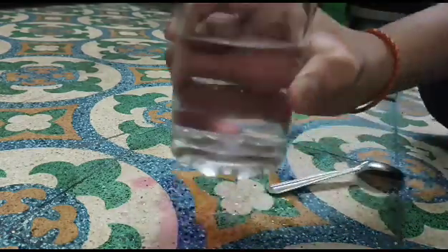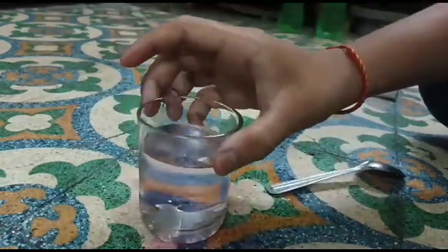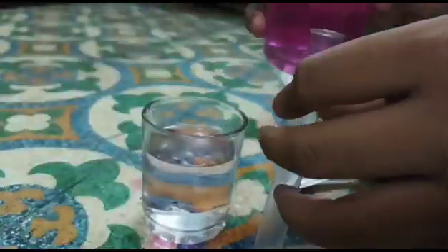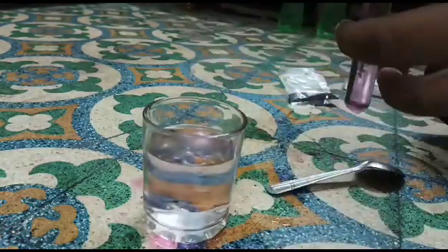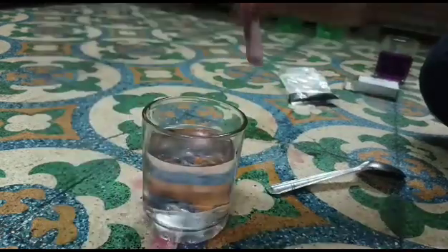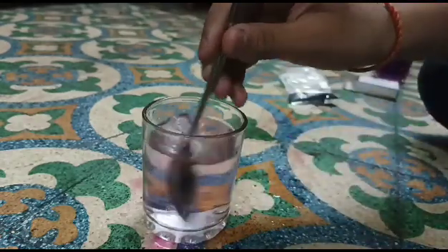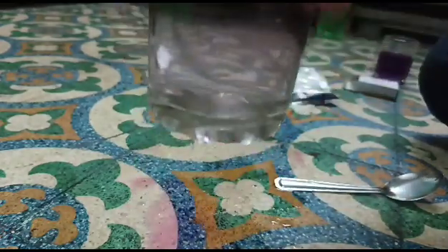See, now this is mostly transparent. So we are adding some more matter, and will the color change? Yes, because the quantity of matter will increase. Some more. See, you can see slight changes in the color of the water. So this was our experiment for today.